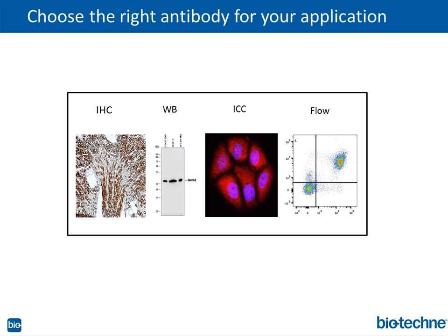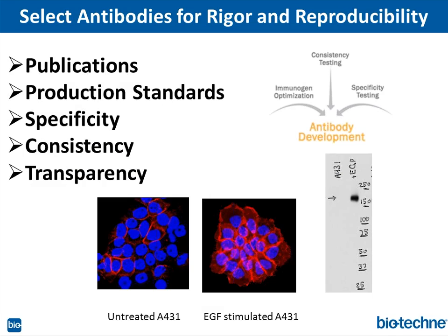There has to be a high signal, and it has to be low noise. It has to be reproducible, and those that don't pass muster don't get released. And what works for one application will not always work for another, obviously. So, a couple things to think about. Of course, the first credible place that people look is publications. This is the obvious thing, and it's a real credibility statement when your colleague uses an antibody.